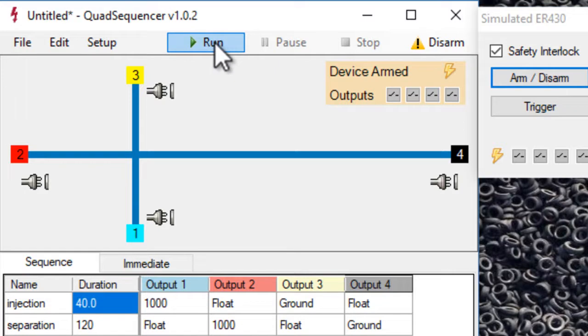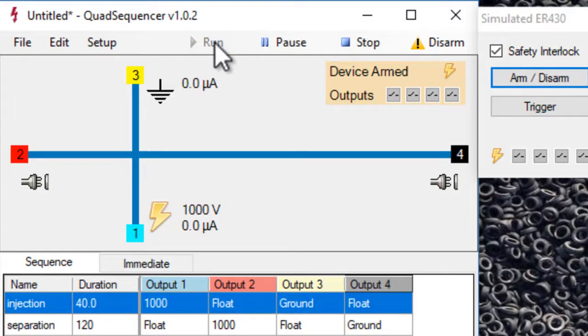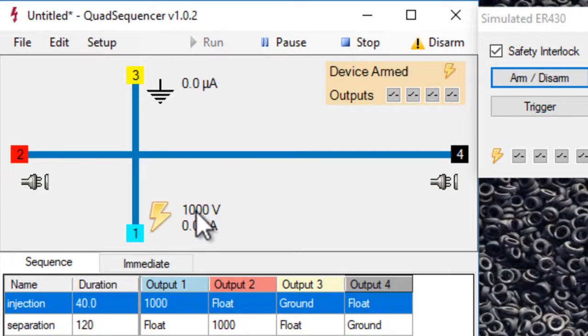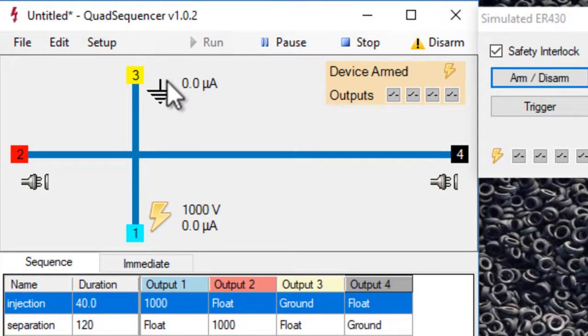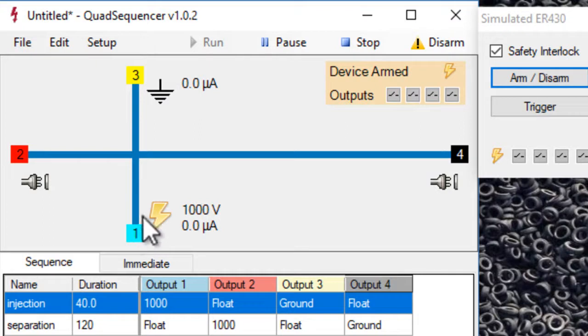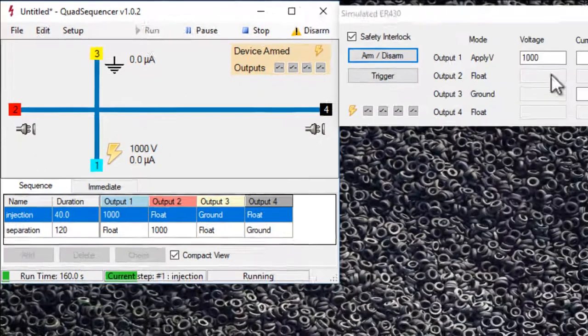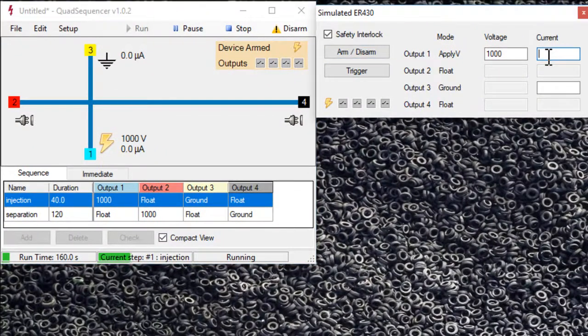I'm going to click run here and you can see it's doing the injection step. It's applying a thousand volts on reservoir one and ground on reservoir three. So there'd be a current flowing here.